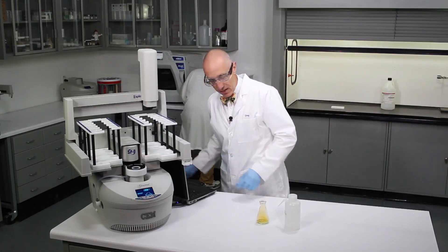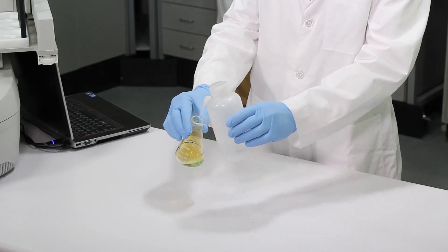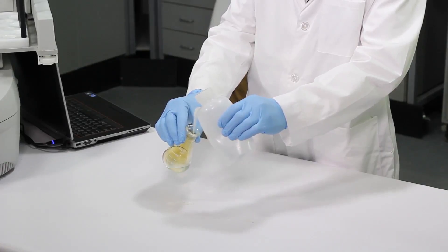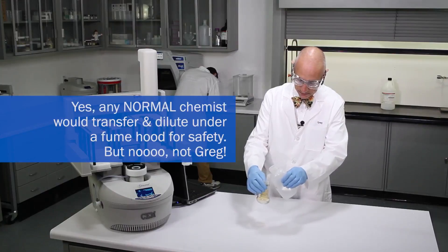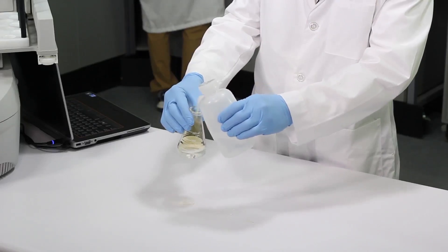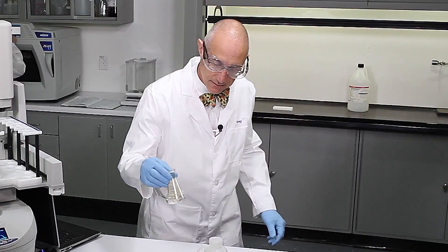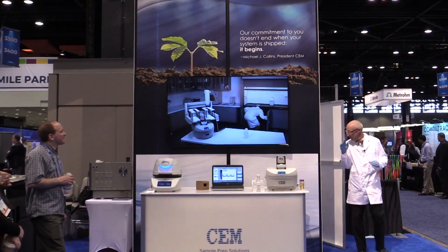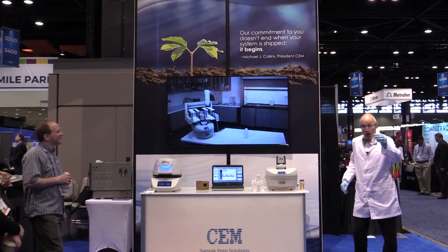Now, we're doing this outside of the fume hood and the OSHA police are not here, so we'll pass on this this time — but normally you want to do it in the fume hood. Get a nice dilution. Looking clear to me. Will it digest dry cheese powder? Yes, it can!